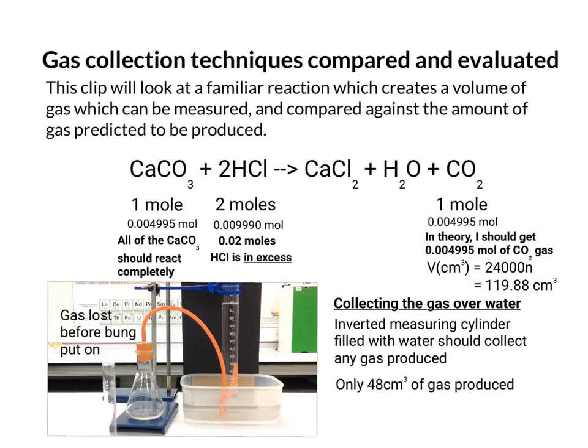So there's some gas lost before the bung is put on. You can see there was a time lag of a half a second or so. And carbon dioxide is actually slightly soluble in water. So some of it might have dissolved as it passes through the water. It's also possible that some gas might still be inside the flask and didn't make it into the measuring cylinder. So maybe this isn't the best technique to do the job with. Let's try another one.